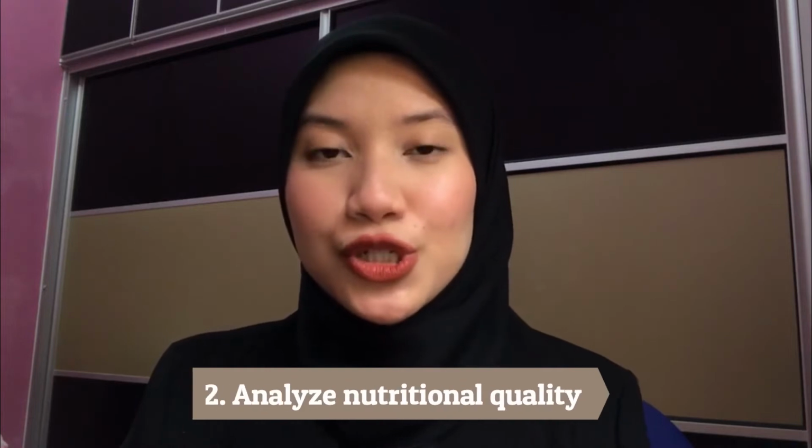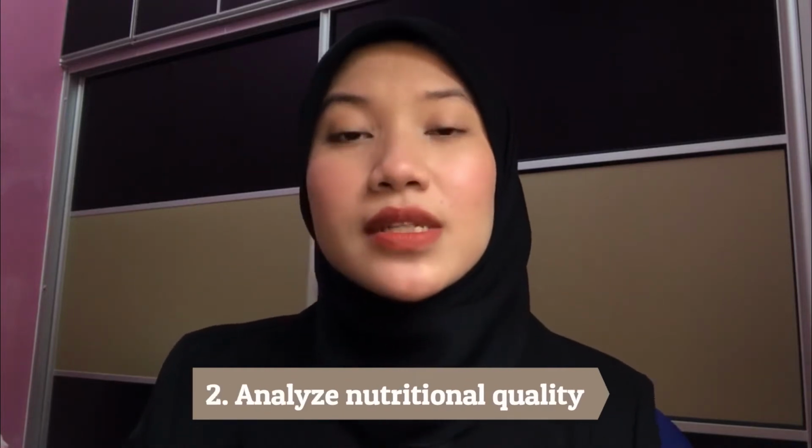spoilage. The second use of HPLC in the food industry is that it analyzes the nutritional quality. It allows the food company to identify components in their product, for example, nutrients such as proteins, vitamins, preservatives, and more. Next, I will explain to you the fundamental information of HPLC.